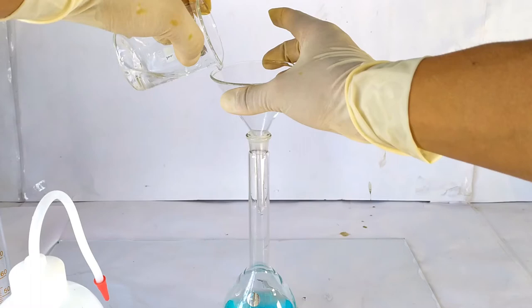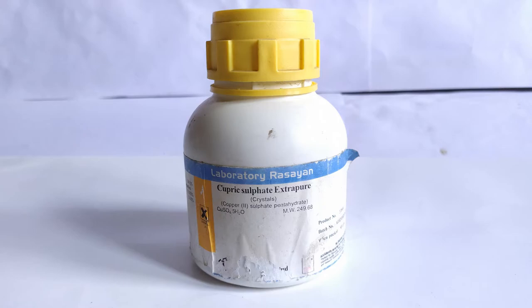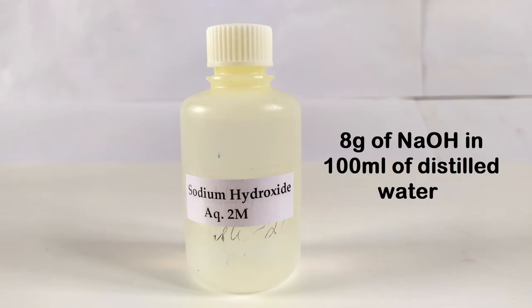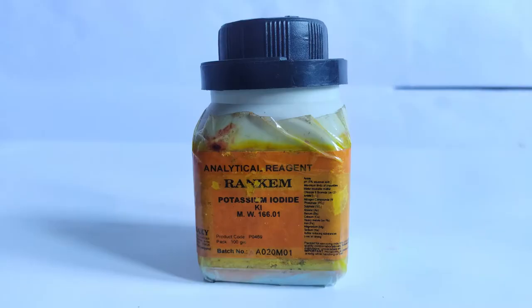To prepare 200 ml of Biuret reagent, you will need the following: copper 2 sulfate pentahydrate, sodium potassium tartrate, 2 molar sodium hydroxide, and potassium iodide.